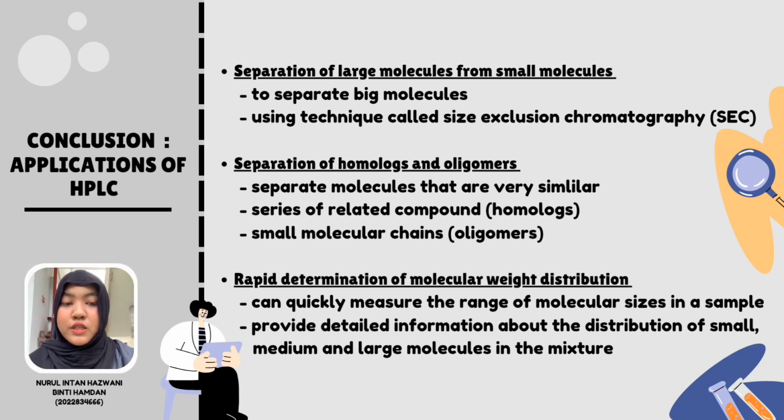These 3 applications highlight how HPLC can handle a variety of challenges in separating and analyzing complex mixtures efficiently and accurately.